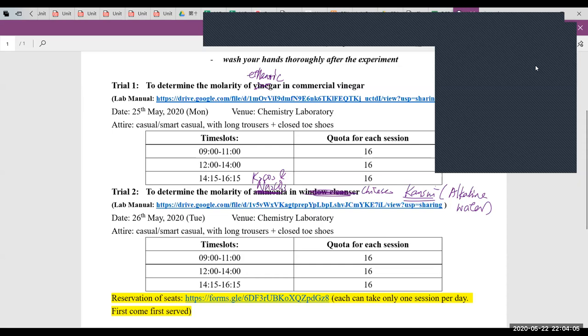So this is what I just shared with you in today's pre-lab session. When you have a pre-lab session, we teachers, together with the lab technicians, also have another pre-lab session. You can get my point. So after thorough discussion, we decided to change it. And gan shui is just the one I bought, just out of boredom at lunchtime while I went to the wet market, and I suddenly thought of this. A very traditional additive, mainly added to noodles while you make them.